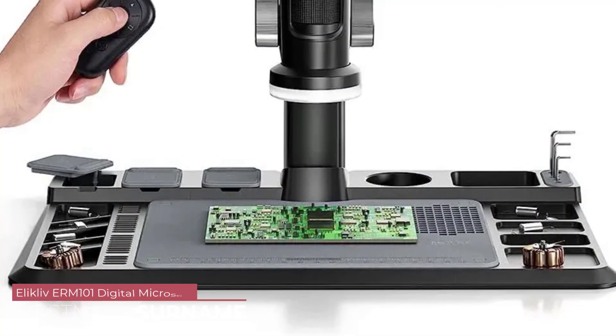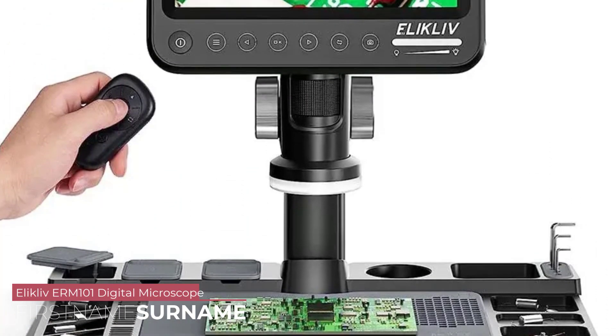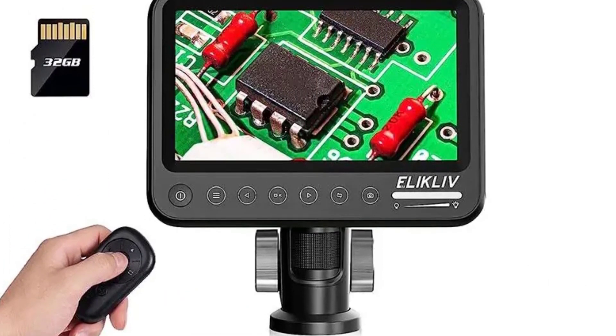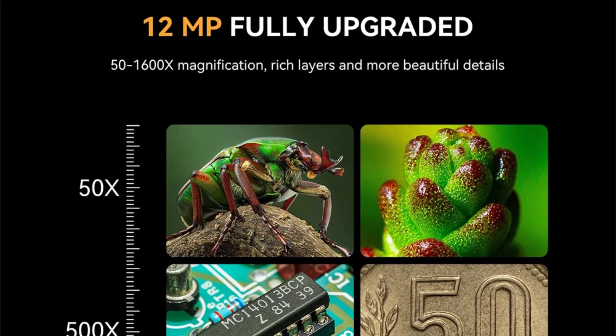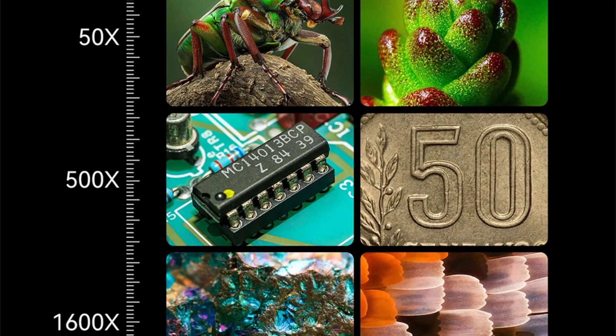Number 4: Elikliv ERM-101 Digital Microscope. The ERM-101 is constructed with a durable aluminium alloy, giving it a robust and premium feel. The monocular draw tube is well designed, providing a comfortable and ergonomic viewing experience. The attention to detail in the build ensures longevity, making it suitable for various applications.